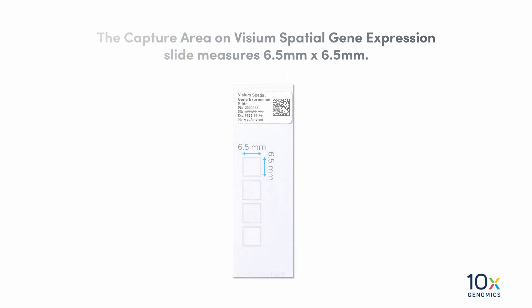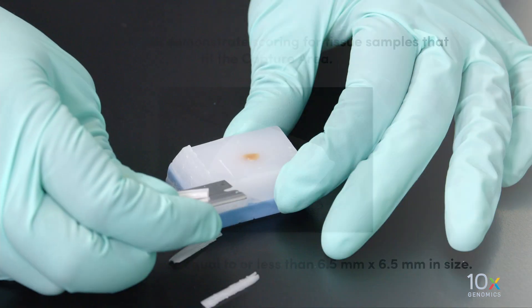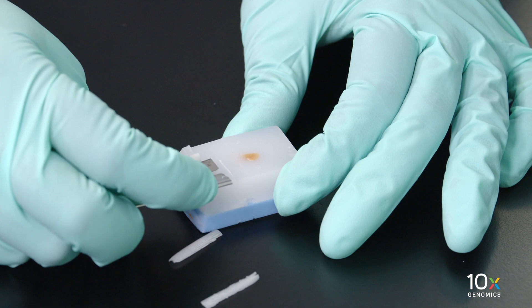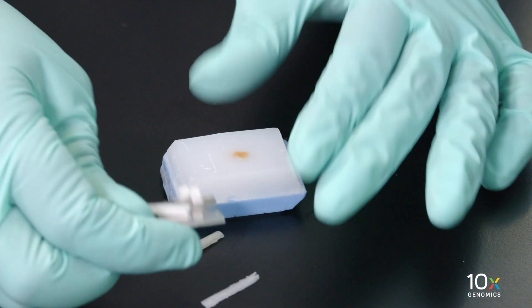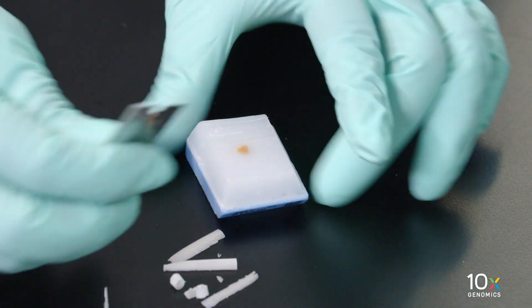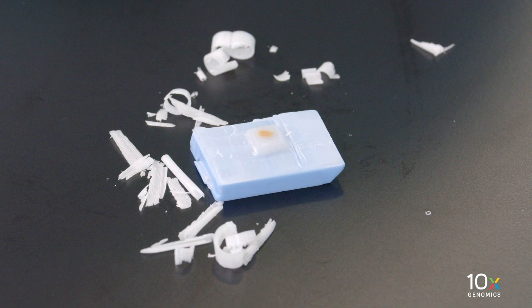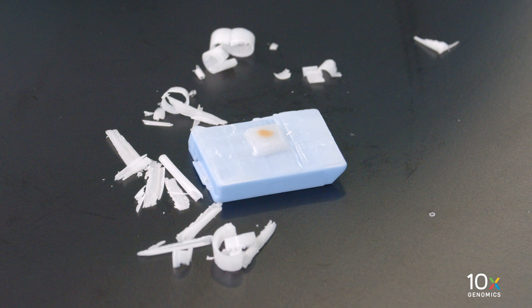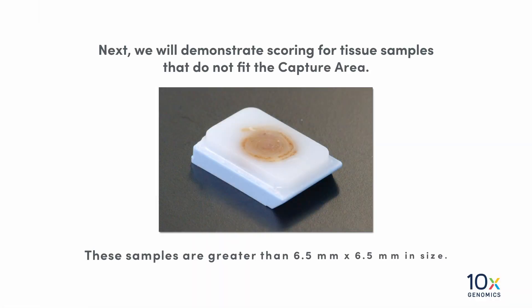First, we will demonstrate scoring for tissue samples that fit the capture area. These samples are equal to or less than 6.5 millimeters by 6.5 millimeters in size. After facing, remove the tissue block from the microtome and start trimming. Using a razor blade, remove excess paraffin from around the tissue so it is not larger than the fiducial frame. Retain paraffin edges around the tissue samples to enhance tissue attachment to the slide.